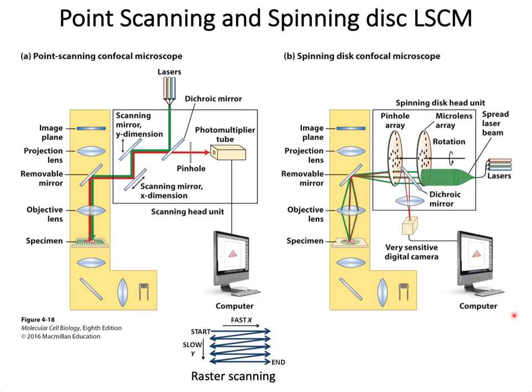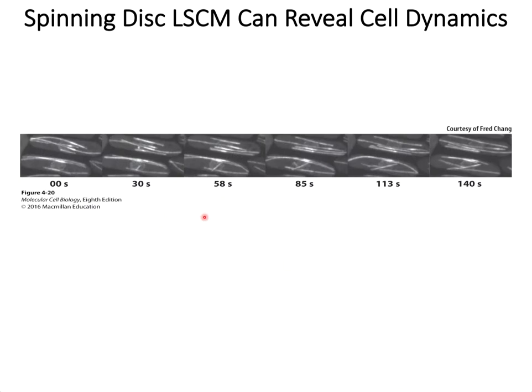recorded. So spinning disk confocal microscopy reveals dynamics in 6 frames of a movie of microtubules in 2 rod-shaped cells expressing GFP tubulin. So take a look at the middle of the elongated bottom cell at the 0 second, and then toward the top of the cell.